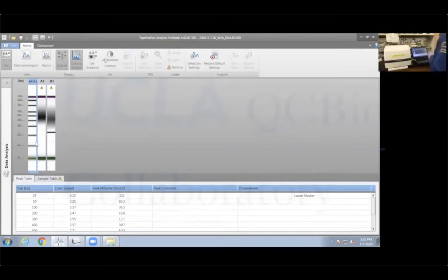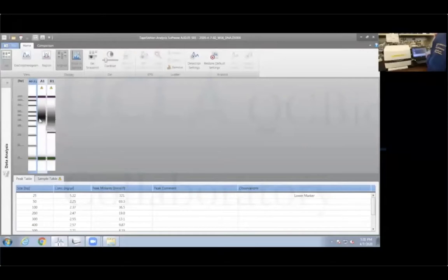So this is the gel image. You can see that the two samples are actually different. Okay, so A1 has just one smear centered around, let's say, 350, 400 base pairs, while sample B, or sample 2, has a peak that is slightly lower, or a smear that is slightly smaller in size, like 350, 330. And it also has another peak right here around 130, 140.